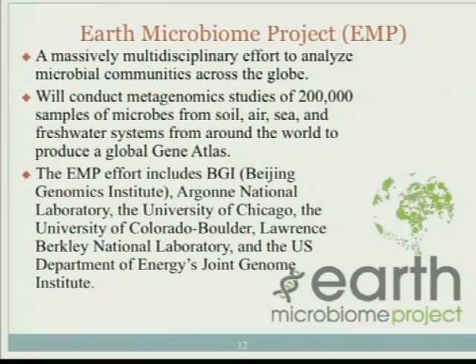Even though Illumina is great, it will probably still be very expensive if you do shotgun for all of them. But you can afford to do a 16S survey for all the samples you can get, and then for a selection of the samples you can do shotgun.